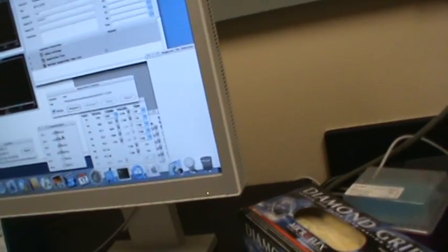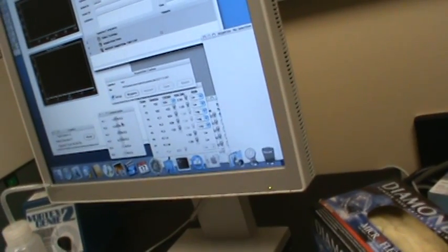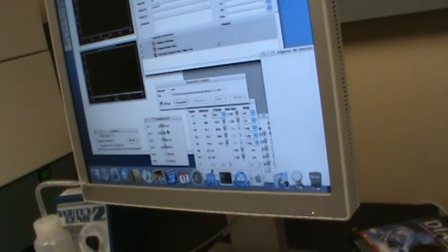Well, do I need to do calibration every day? No. You've already done it, usually weekly. Usually weekly? Okay. Yeah. Or if you know that there are multiple users and they're using different types of cells, that's when you use it. But we don't have a lot of users on this one, so weekly would be fine. Okay. All right. That makes sense? Yeah.